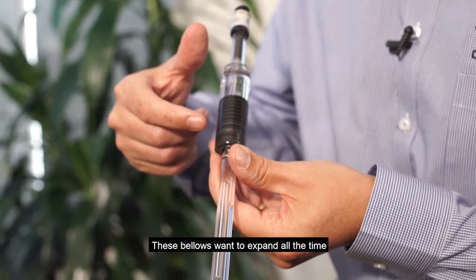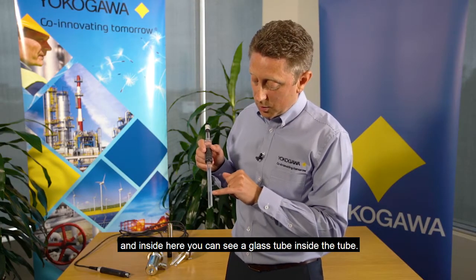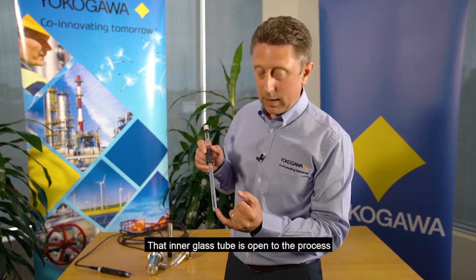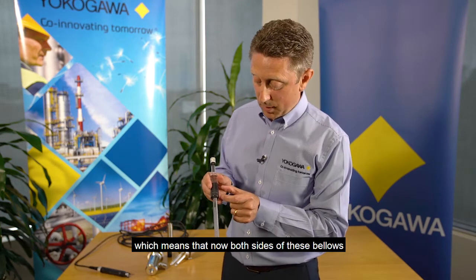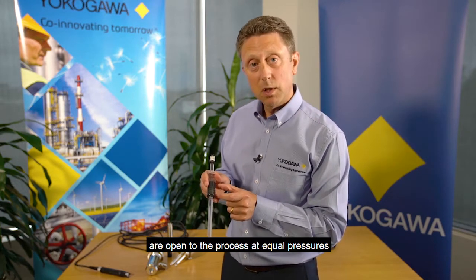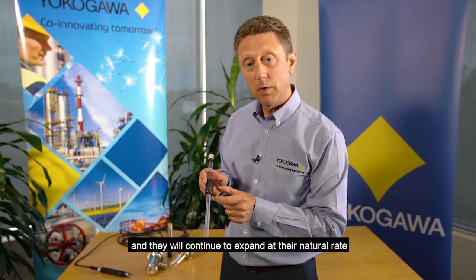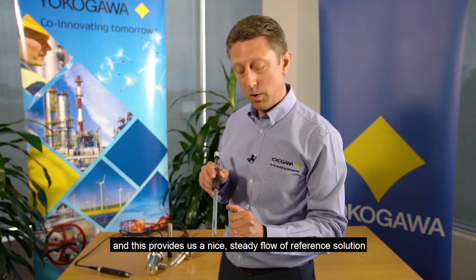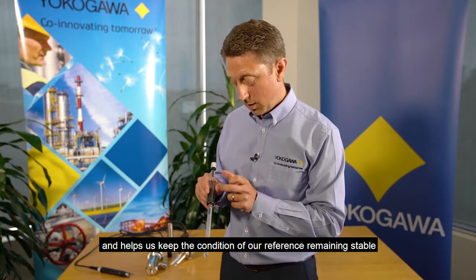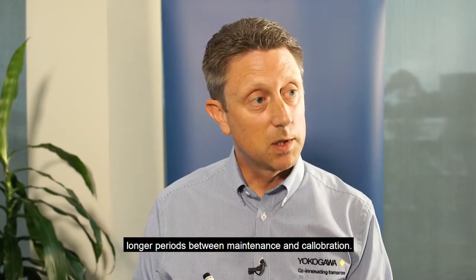These bellows want to expand all the time. Inside here, you can see a glass tube inside the tube. That inner glass tube is open to the process, which means that now both sides of these bellows are open to the process at equal pressures. They will continue to expand at their natural rate, and this provides us a nice steady flow of reference solution. It helps us keep the condition of our reference remaining stable for much longer periods and enables longer periods between maintenance and calibration.